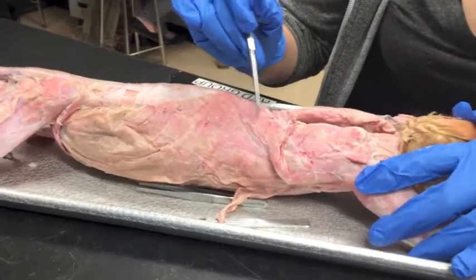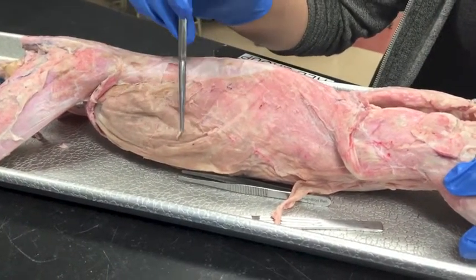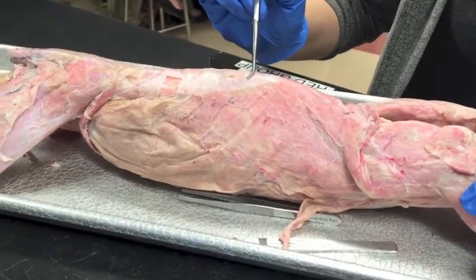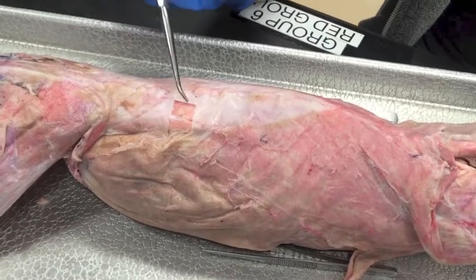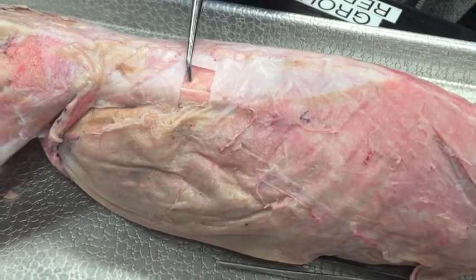This muscle right here is the latissimus dorsi, this is the external oblique, then we have the lumbodorsal fascia — this white part — and underneath two layers of that is going to be the sacrospinalis.